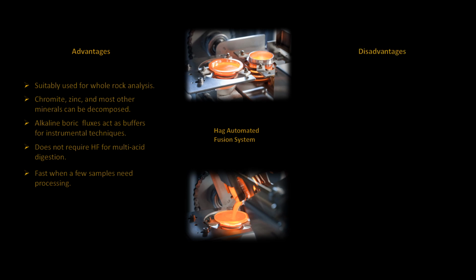But like everything else, there are disadvantages, especially when it relates to instrumental analysis, which is beyond the scope of this series. However, these disadvantages also relate to gravimetric and volumetric analysis, which will be discussed in a future presentation within this series. Coagulation and flocculation, simply put, are a form of minute solids within a solution. In regards to molten solutions, these are small pieces of material that have not melted and remain as solids.